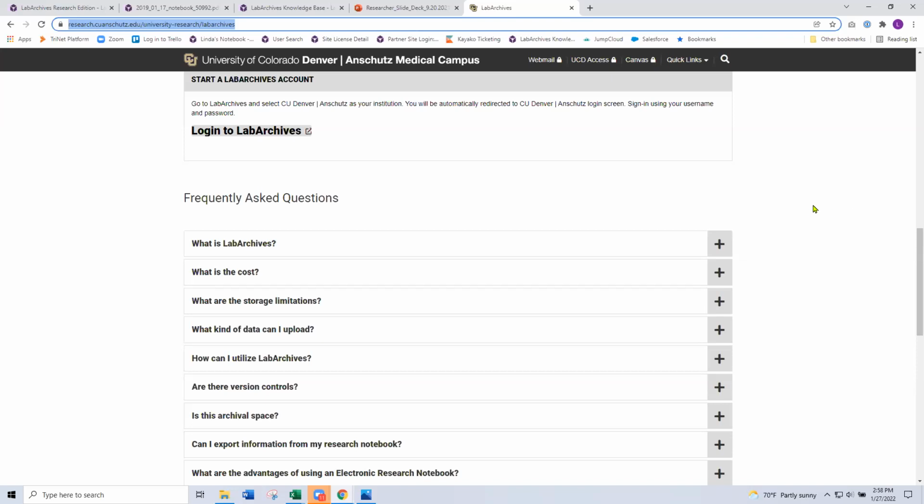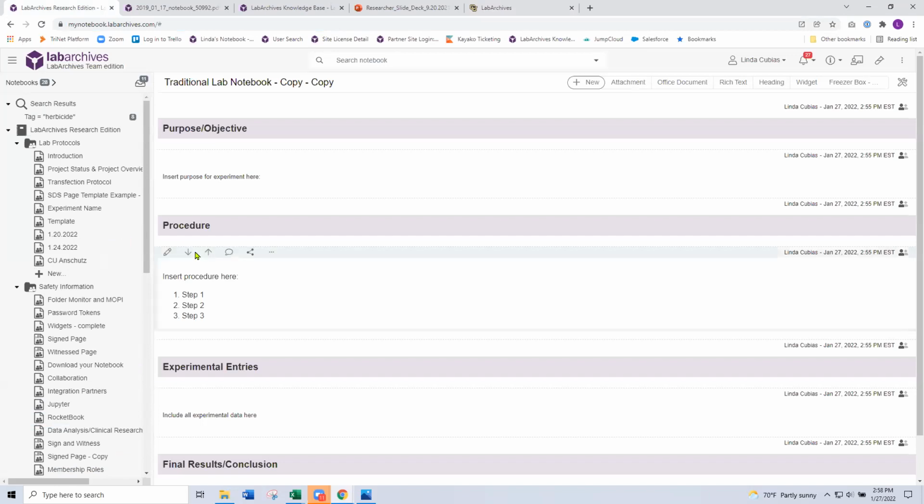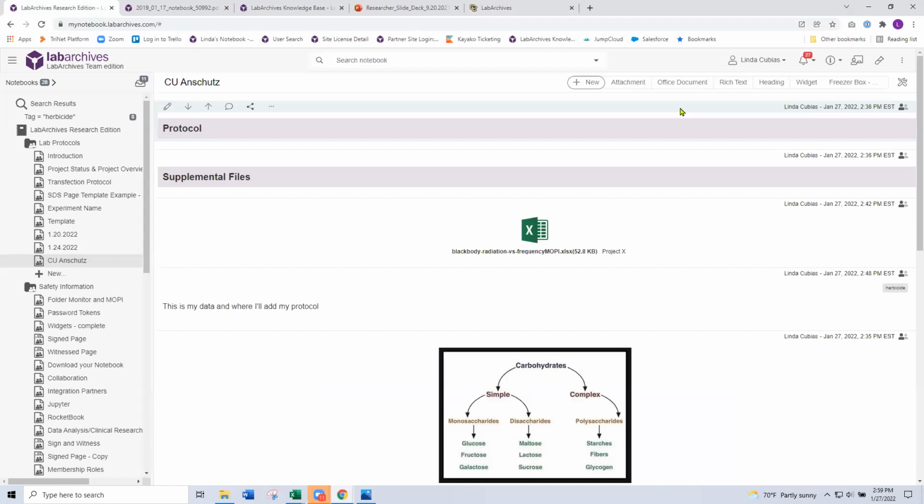The other thing that you could do, when you do our attachment upload, remember that you can upload up to 50 files at a time. You might also look at, Nicholas, using Folder Monitor. So if you have the files locally on your PC, use Folder Monitor to create a rule, and we'll upload all of the data and retain the folder structure. But if you don't want individual files, it's a little tricky. The only thing I could recommend is uploading as a zip file.